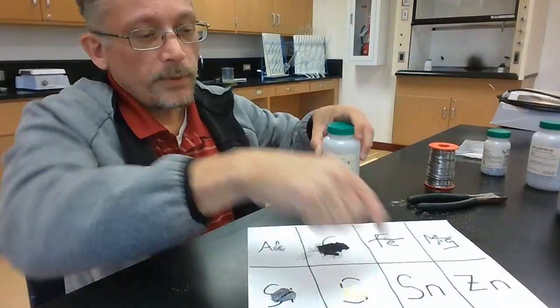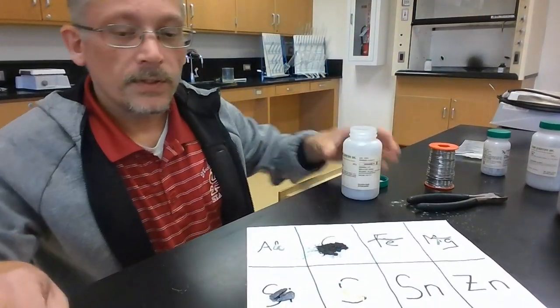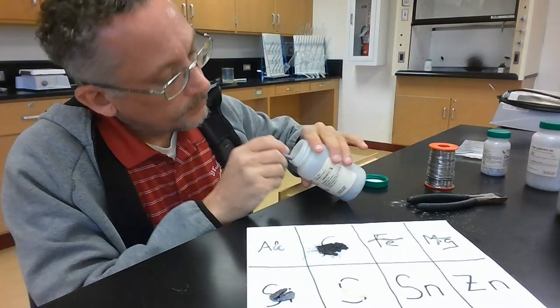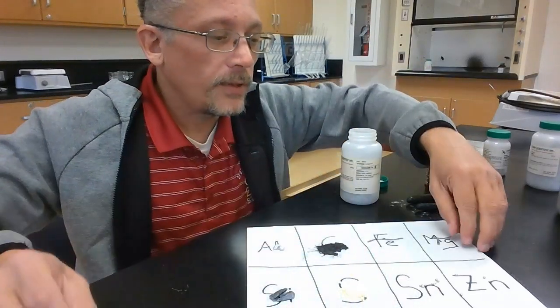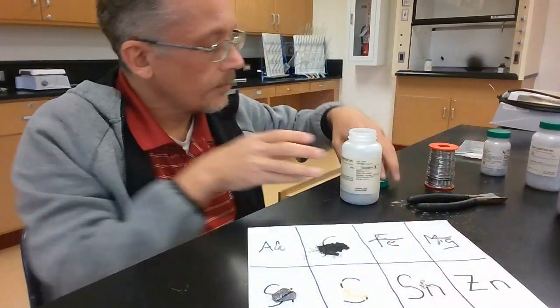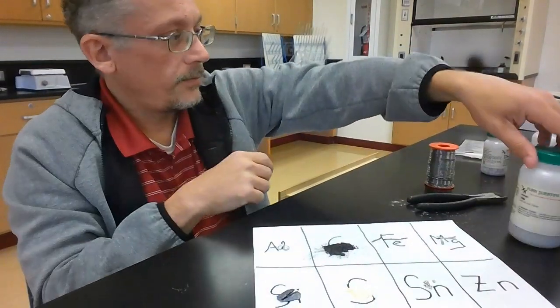Then we'll need a couple pieces of tin next. There are some pretty small pieces of tin in here. Going to get a few and put them on there. They'll go everywhere. And then finally, zinc.